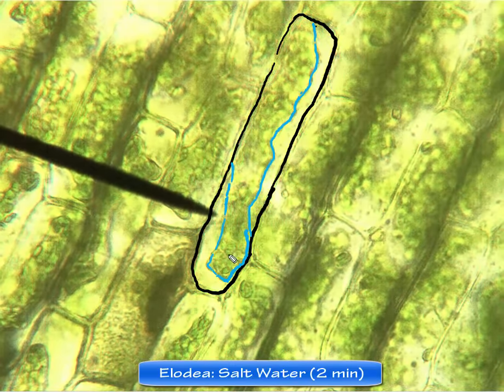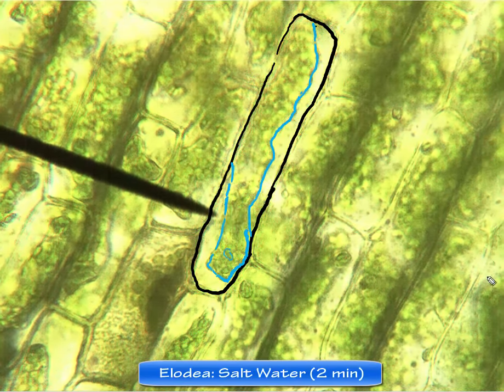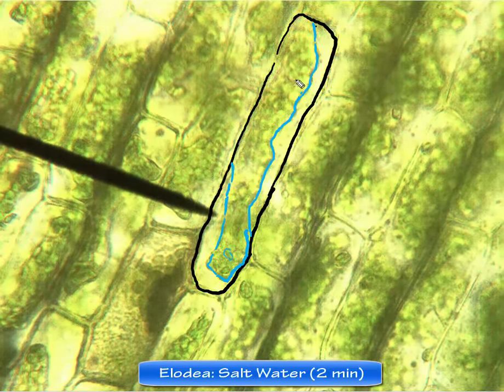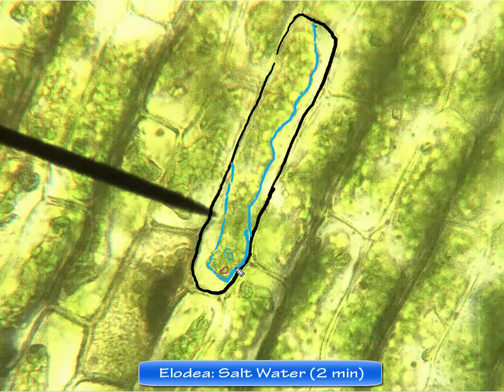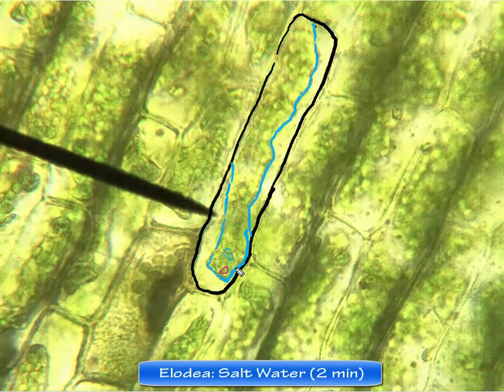Switch to a smaller size. There's one right there. I'm going to switch colors too. I'm going to go to pink just to outline. But there's one right there. There's another one that's pretty obvious right there. And so they are now tightly packed, and they're no longer moving around freely inside of the cell.